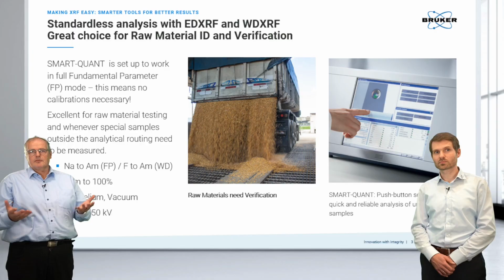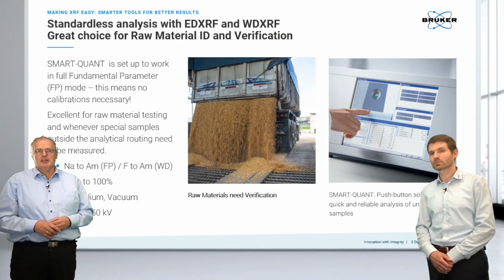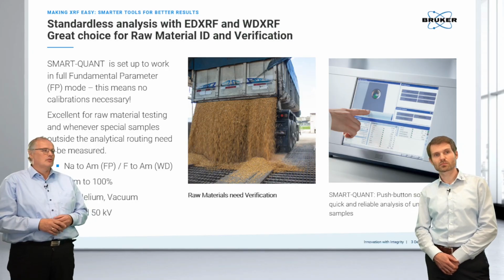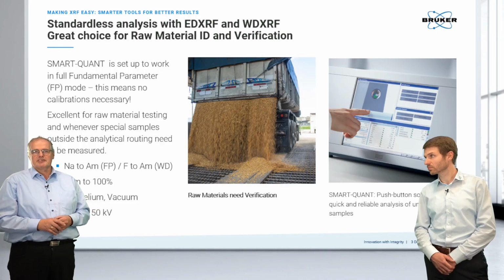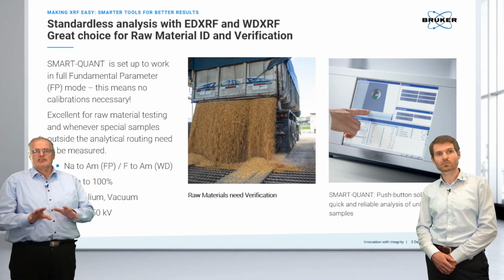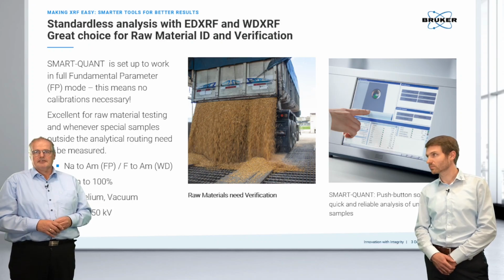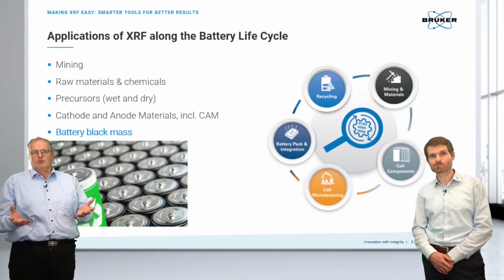And it works from sodium to americium with the SMART-QUANT FP in the ED world, and from fluorine to americium in the wavelength dispersive world, from ppm range up to 100%, and for helium or vacuum mode. And actually it uses the broad band of all instrument features. And Adrian is now jumping into the applications to show us how this works.